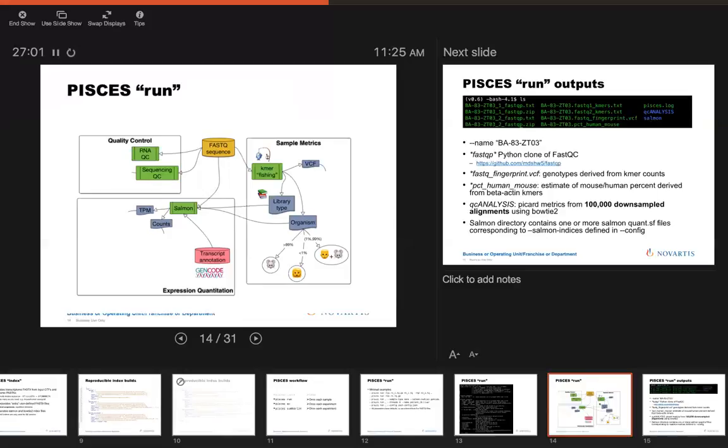For every SNP, you just have 4 K-mers. Each K-mer represents top or bottom strand, major or minor allele. And if you track all of these 4 K-mers for as many SNPs as you need, then you can do a very simple inference of the genotype at that position.